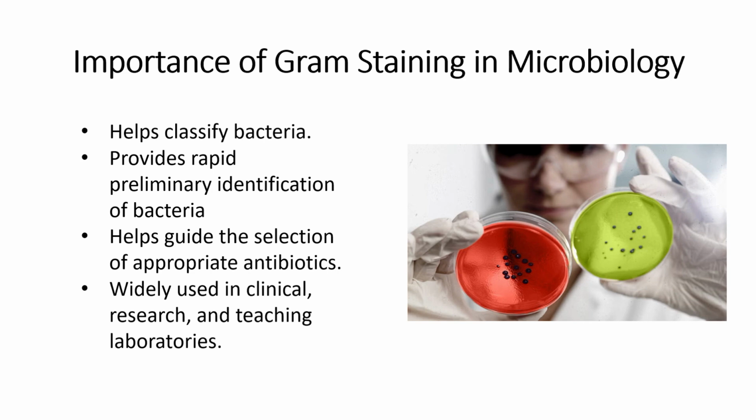Finally, gram staining is routinely used in clinical laboratories, microbiology research, teaching laboratories, and diagnostic microbiology. It remains one of the most fundamental techniques every microbiology student should understand.